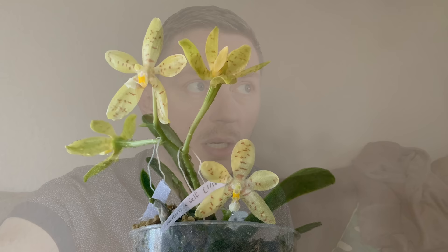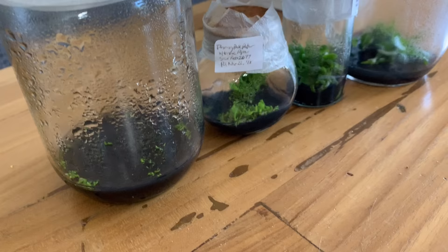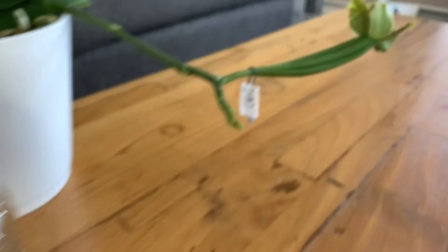I had a Phalaenopsis Palins seed pod pop about 10 days ago so it's been open for a bit, but that shouldn't prevent the process, and if anything I can at least show you the process I go through on sterilizing the seed pod. Before I get into the details I do want to walk you through the process that we go through when sowing orchid seeds.